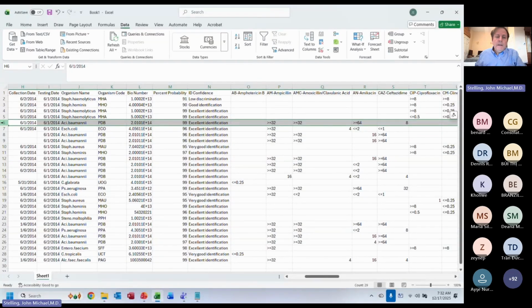They don't do one row per isolate. They do one row per antibiotic. So there will be one row for ampicillin, one row for penicillin, one row for ciprofloxacin. They're both fine. BacLink has no trouble with the horizontal or the vertical. We just need to tell BacLink which one we have. So for the Vitek 2, the antibiotics are organized horizontally.